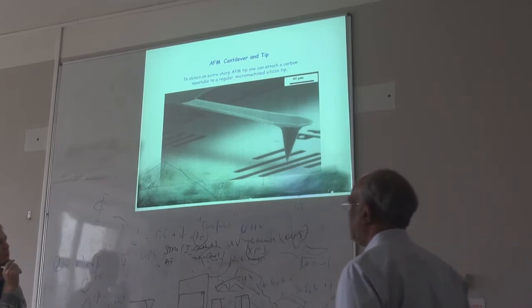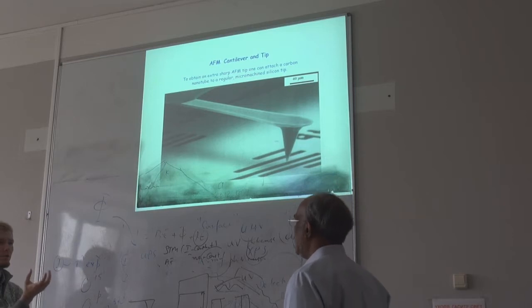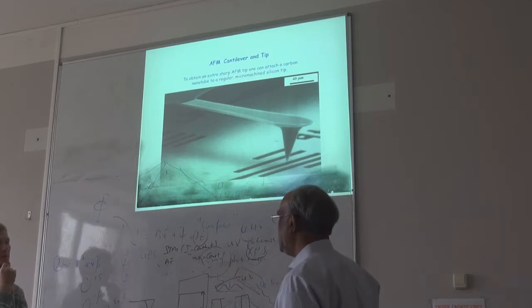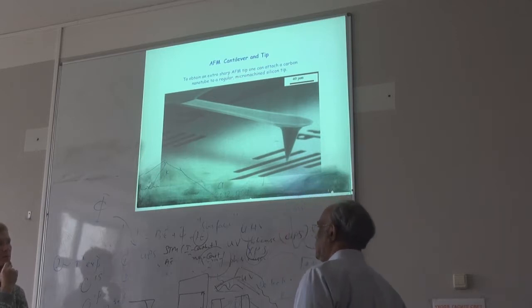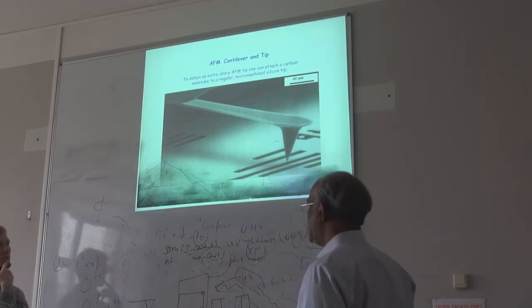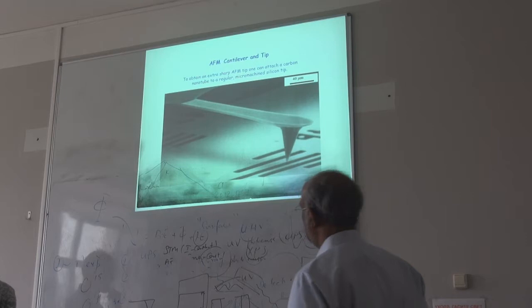What about the resolution of the translational stage? Oh, that you can control at the sub-micrometer scale easily. Is it a piezo? Yes, they are all piezo.